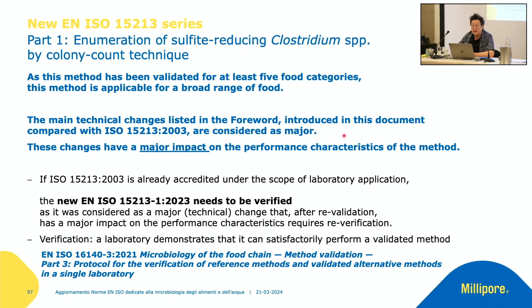So the main technical changes have a major impact on the performance characteristics of the method. I showed you the main technical changes, for example, the changed agar, the new confirmation, and so on. That means if a lab has already been accredited for the former method, ISO 15213, the lab has to re-verify the new part one method according to part three of ISO 16140.